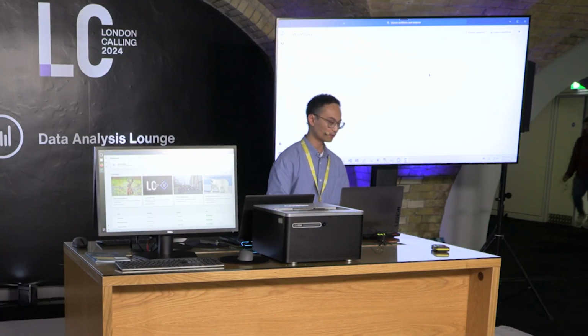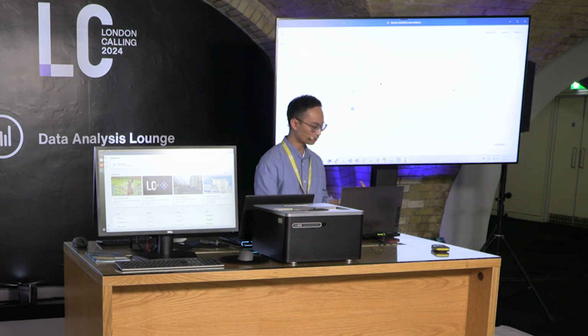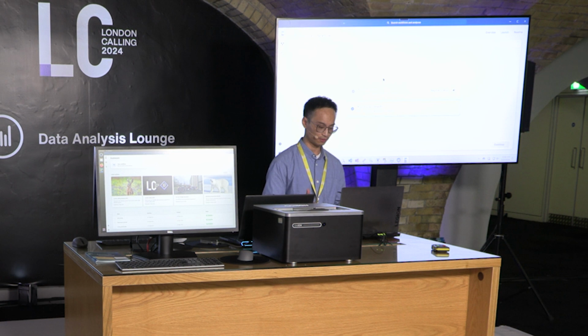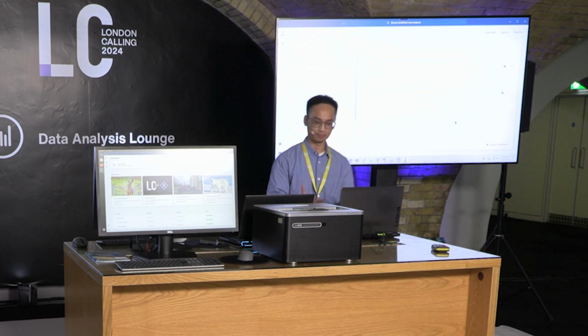So what we're going to do first is launch this workflow by selecting workflow here, and we're going to select run this workflow. It's going to take a couple seconds to do some back-end dependency checks. Hopefully that won't take too long. And then we're going to click continue. And so this will bring us to the run setup page.